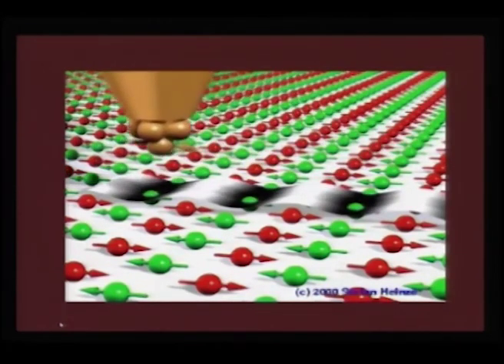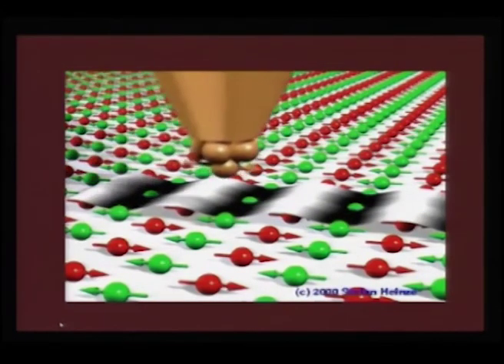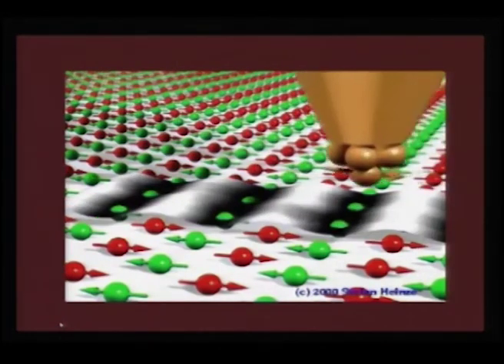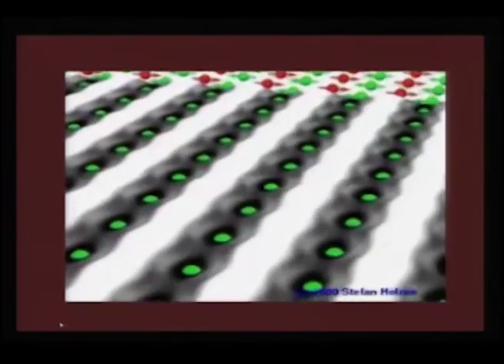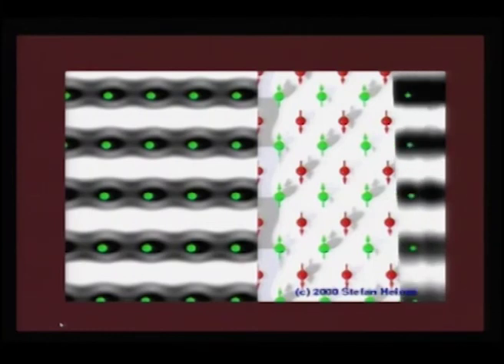The brighter areas represent the ferromagnetic alignment with respect to the tip, and the darker areas will represent the antiferromagnetically aligned region. So, if you have a magnetic tip, then it is possible for you to map an antiferromagnetic image, and this is how it will proceed. Finally, you will get a topography like this, which will give you a dark and white pattern, which will clearly say that your surface is an antiferromagnetic surface.